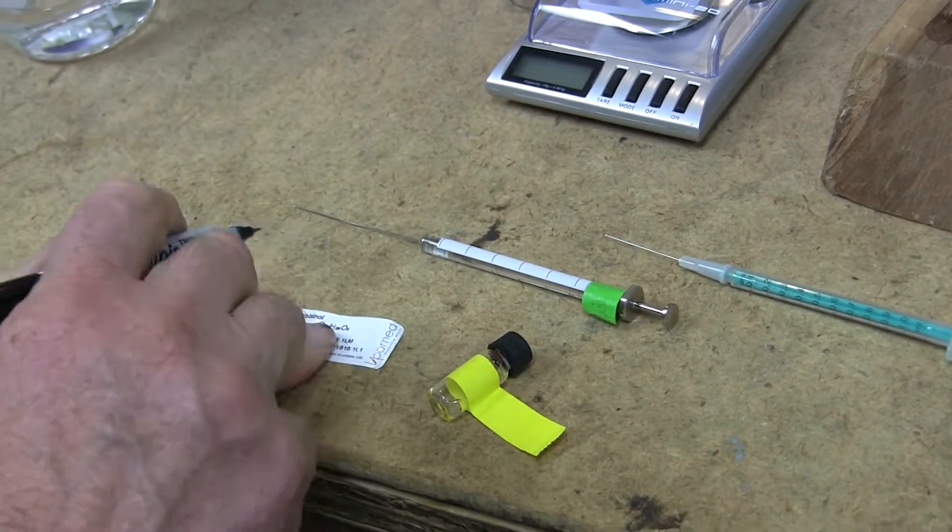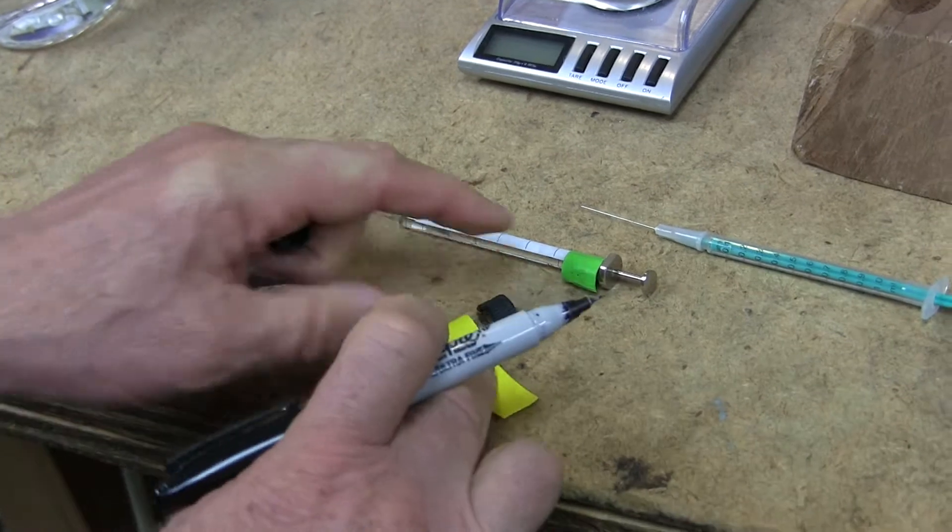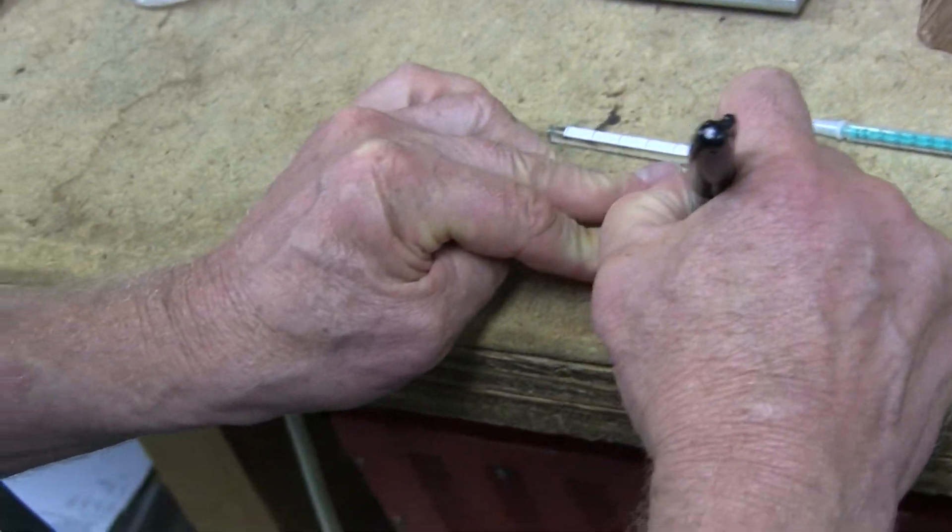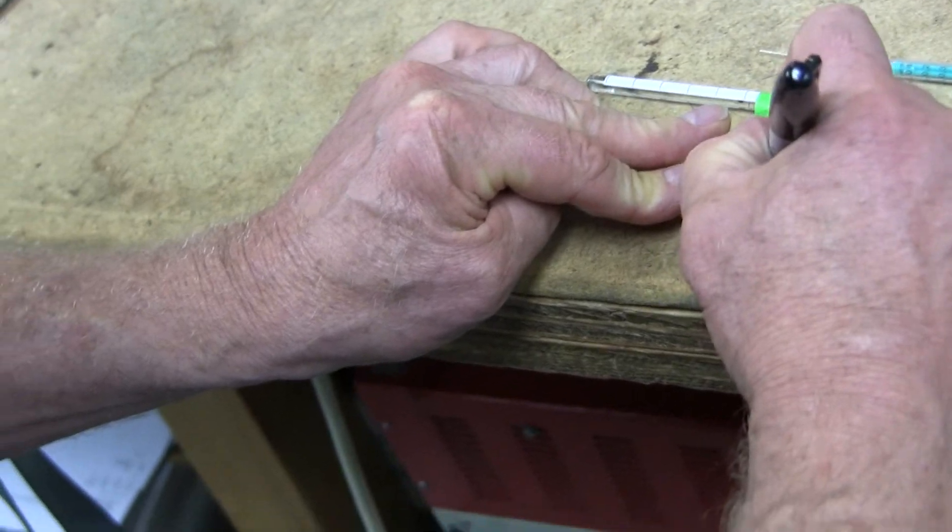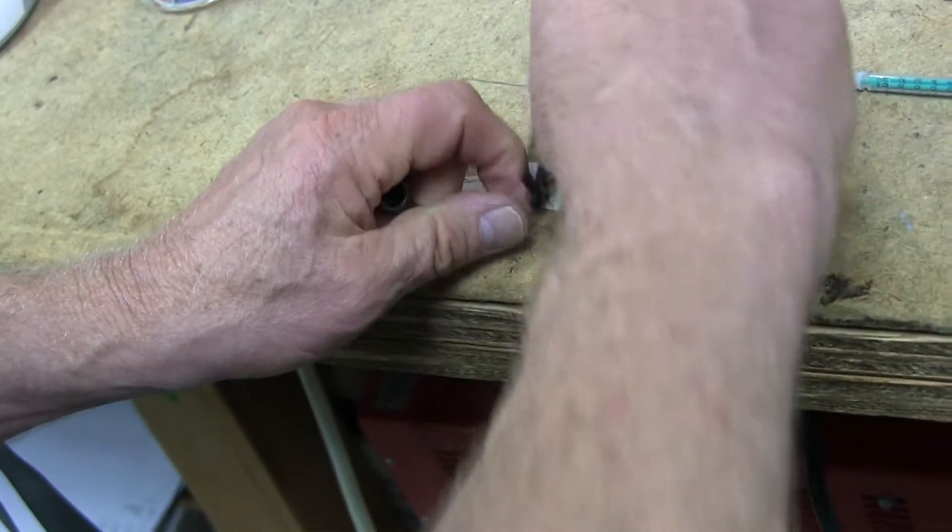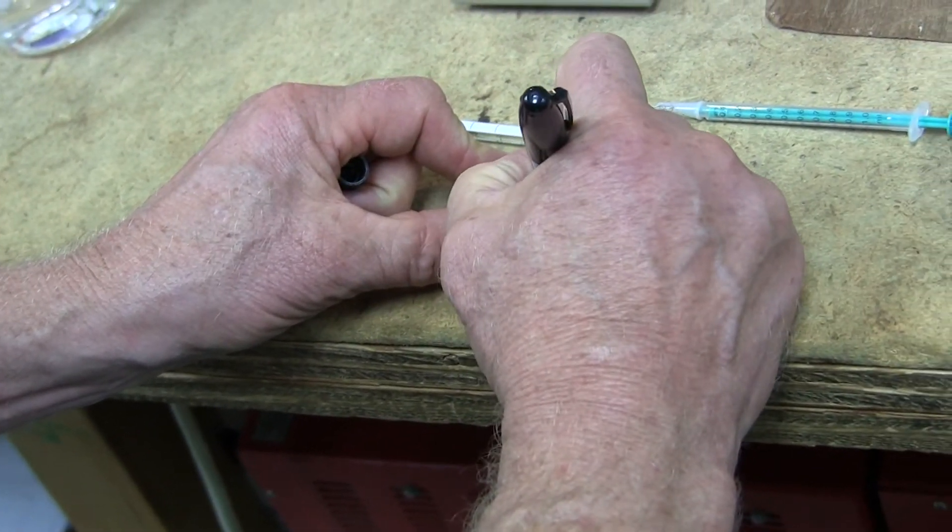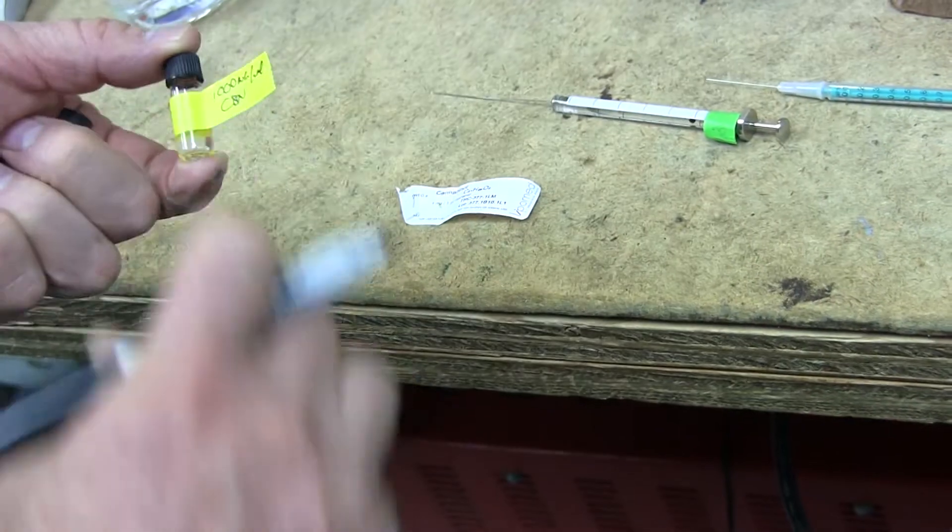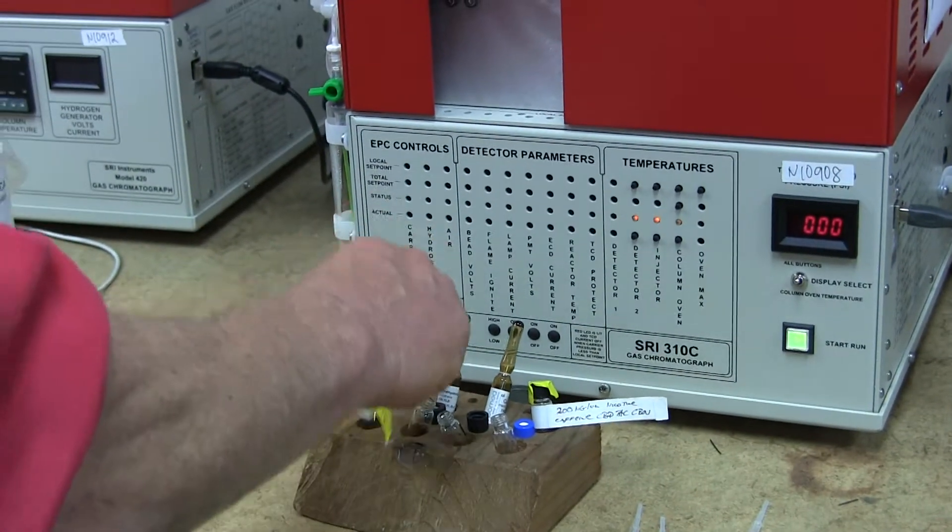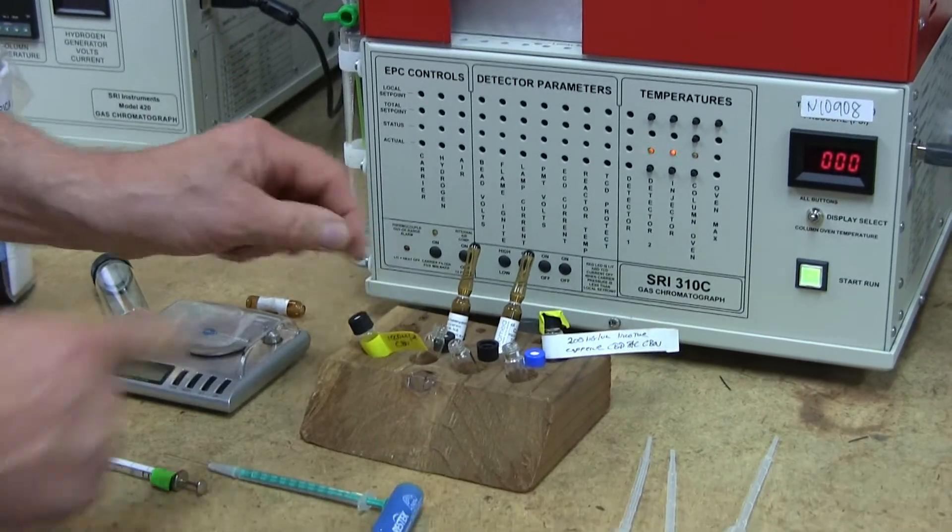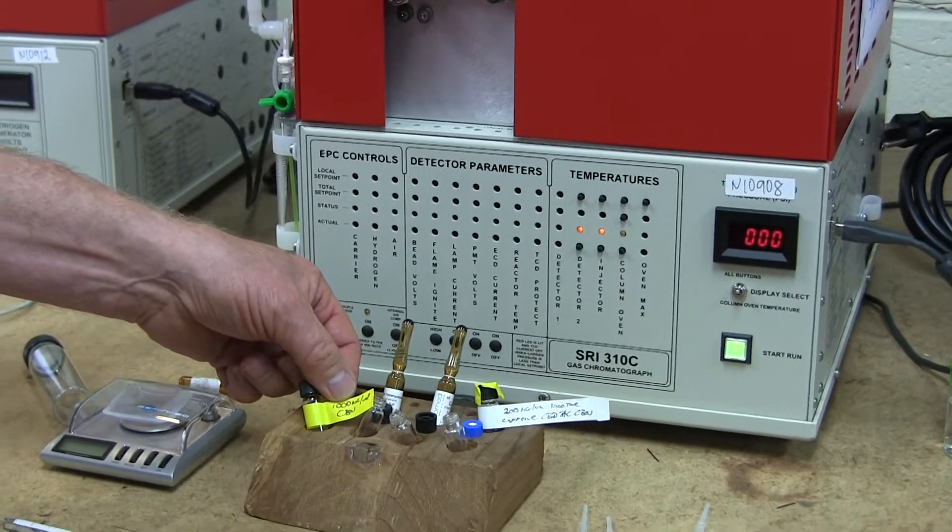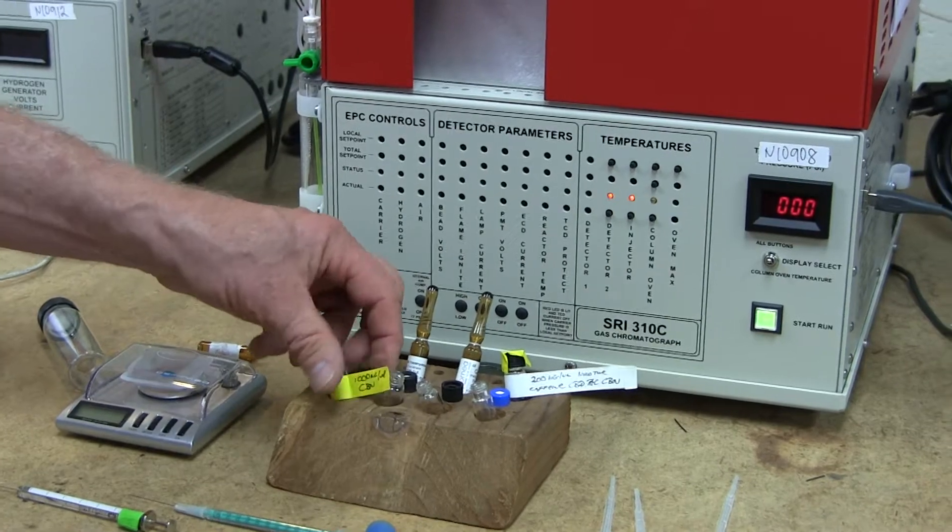But I kind of like to just write the identifying number right on there. So this particular stuff is cannabinol, which is CBN. So I'm going to put this as 1,000 nanograms per microliter CBN. And on the back, I'm going to put the date, which is 6-6-17. Okay. So there's our CBN standard and its concentration in this bottle is a tenth of a percent, which is the same as 1,000 nanograms per microliter.